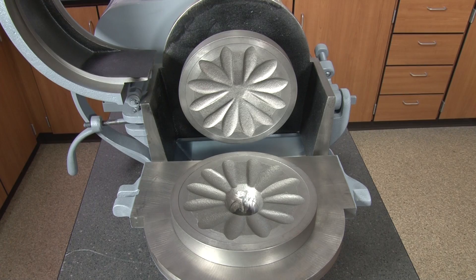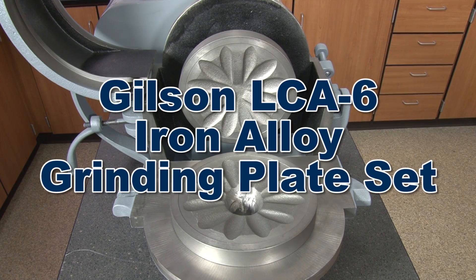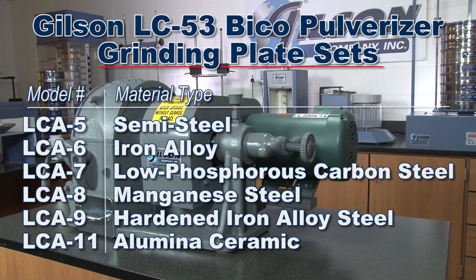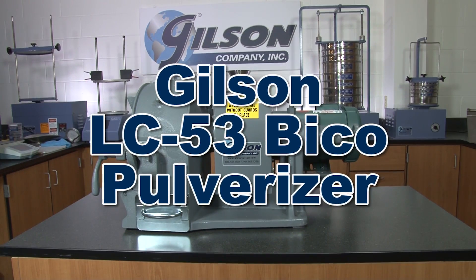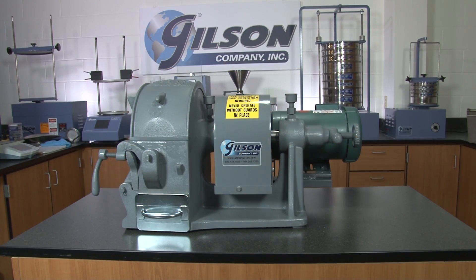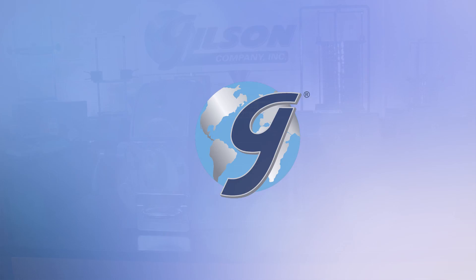Both stationary and revolving grinding plates are easily replaced, and the LC53 Pulverizer includes a Gilson LCA6 iron-alloyed grinding plate set. Gilson offers a variety of grinding plates to provide you with the best performance for your sample type, making the Gilson LC53 Bico Pulverizer the right choice for your material testing lab.